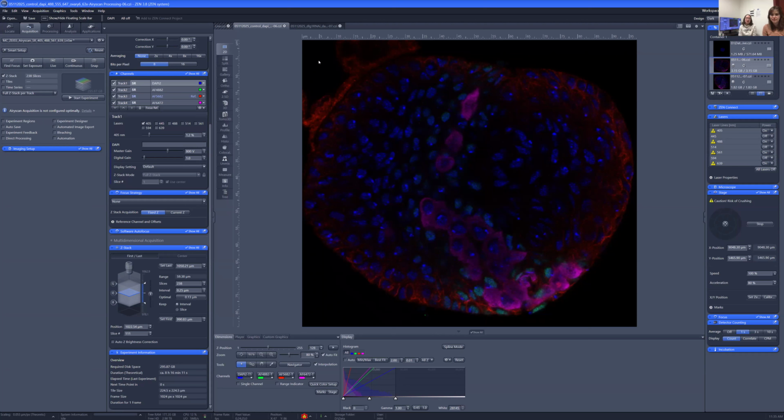But now I'm going to talk a little bit about the experiments that I do to actually understand what controls this process. I have a list of potential genes that regulate the number of egg stem cells. And so in my experiments, I have two groups of samples for every experiment that I do.